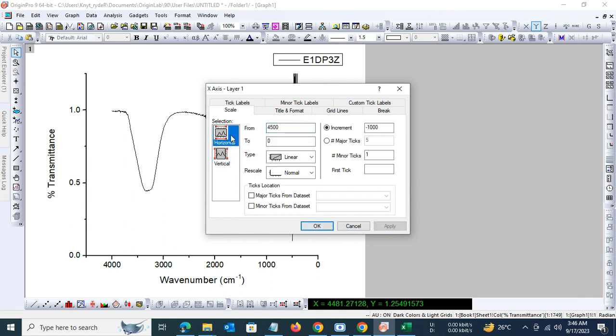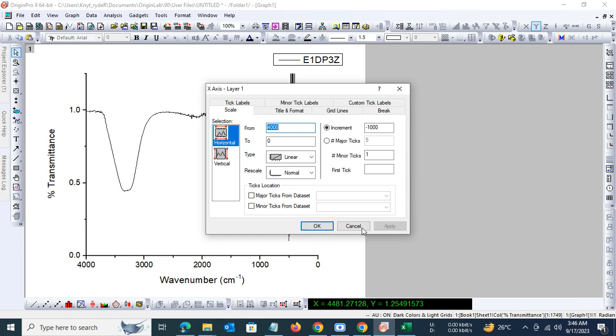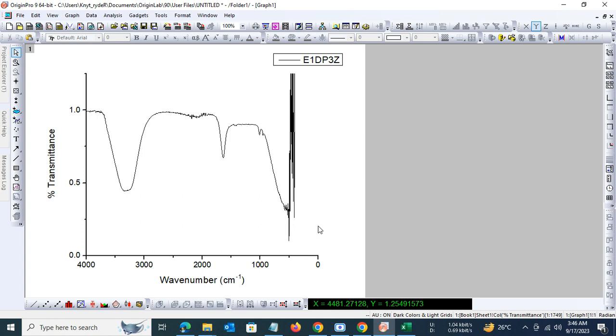And the horizontal axis, let us begin it from 4000. Okay, so here we have our IR spectra and it looks pretty good. The peaks are there.